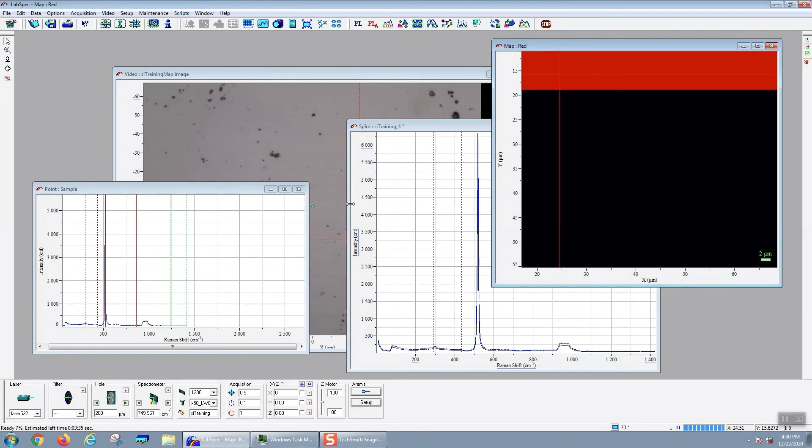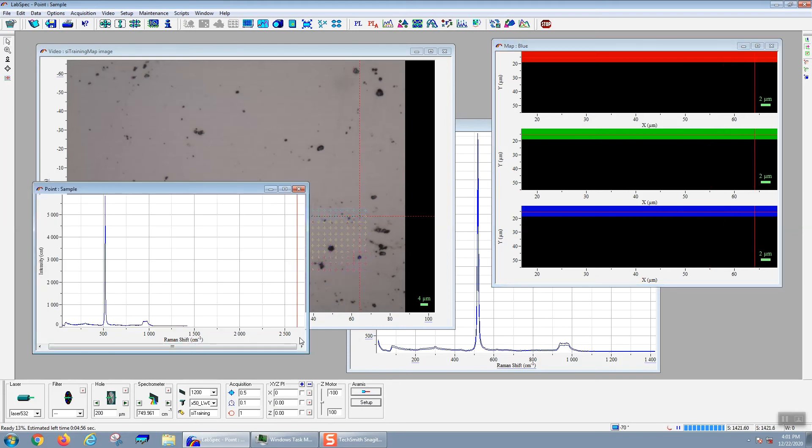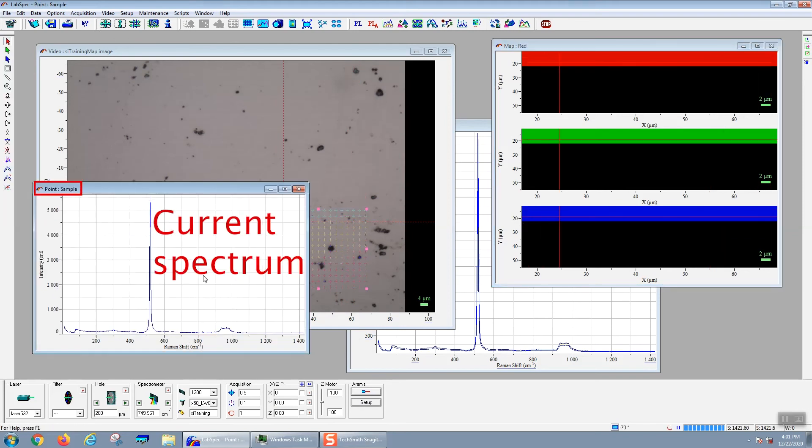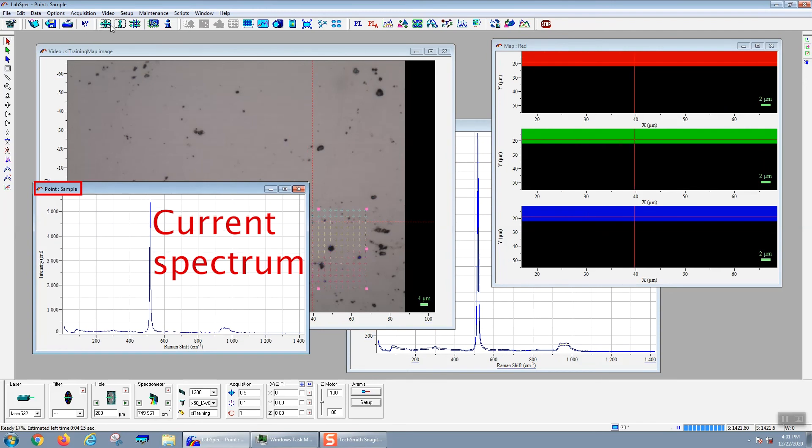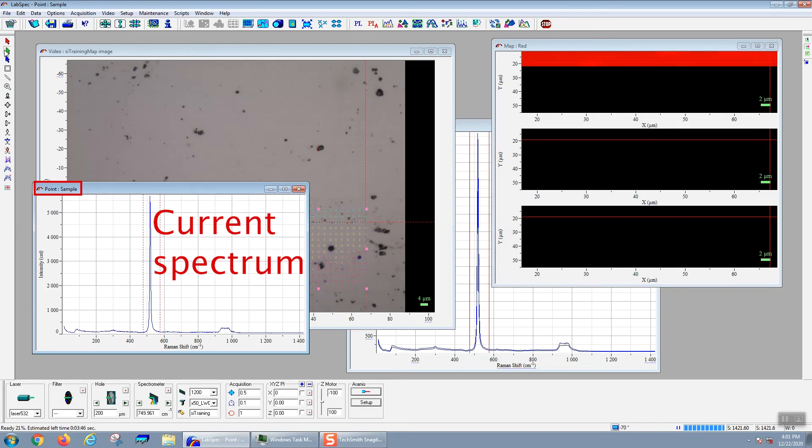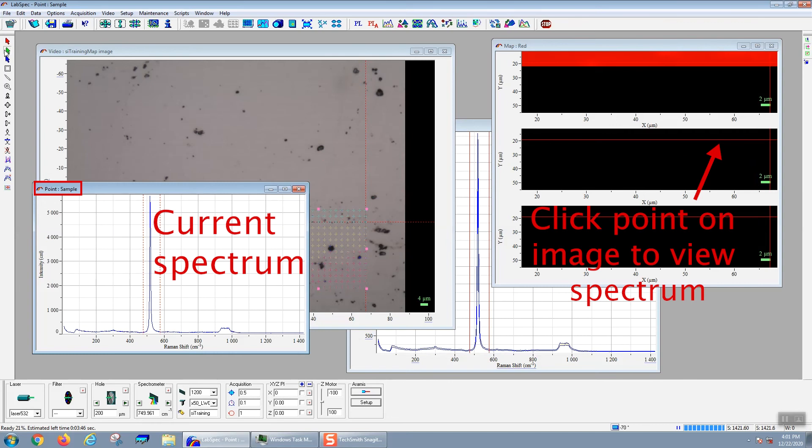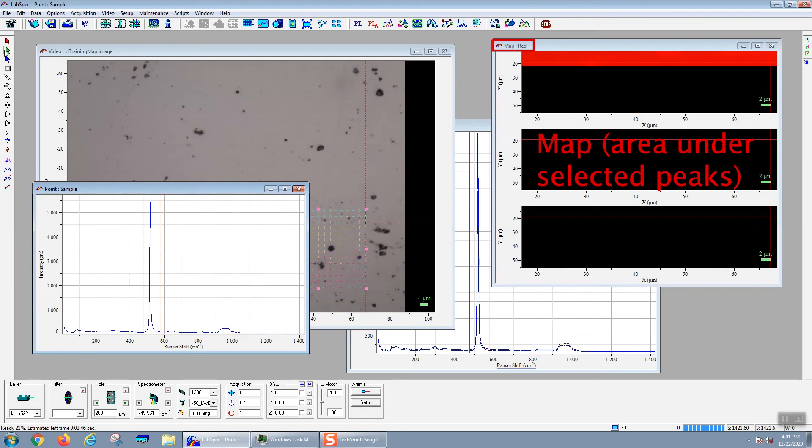The hardest part about mapping on the Haribo Raman microscope is not acquiring the data, but it's navigating the user interface. For mapping, I would recommend having three windows open. The first is the point window that shows you your spectrum. Most of the time when you're acquiring data, this spectrum will be the last spectrum that you acquired. But you can actually go to any given point on your map and view the spectrum using the crosshairs tool. You can set the crosshairs either on the video image, this is the grayscale camera image, or on this map window. The map window will give you colors for different pixels depending on what you set those colors to be.